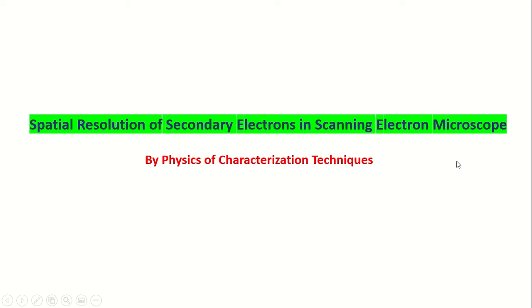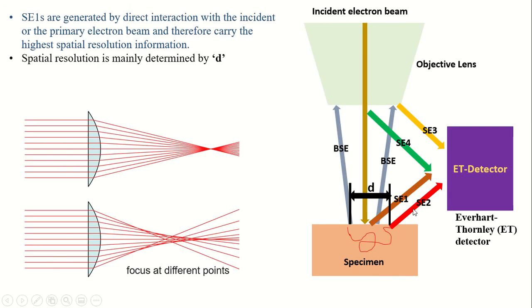So chiefly here I will talk about the spatial resolution of the secondary electrons in a scanning electron microscope. But before starting this, let's take a quick review of what we have learned till now.